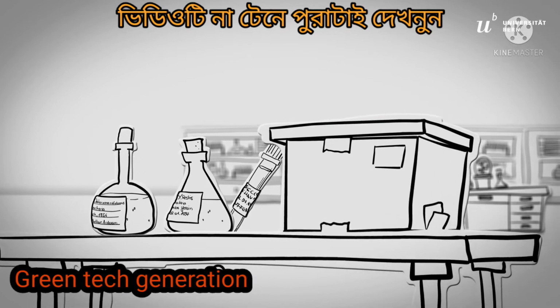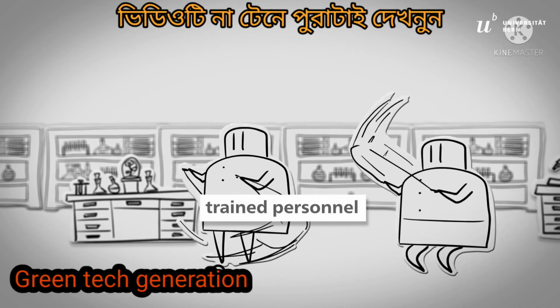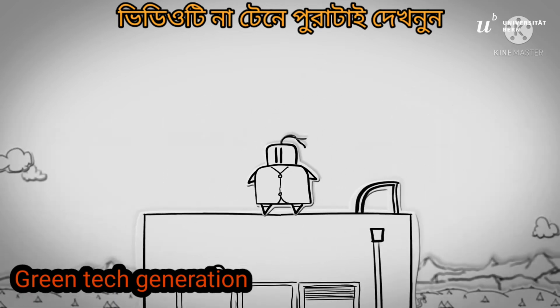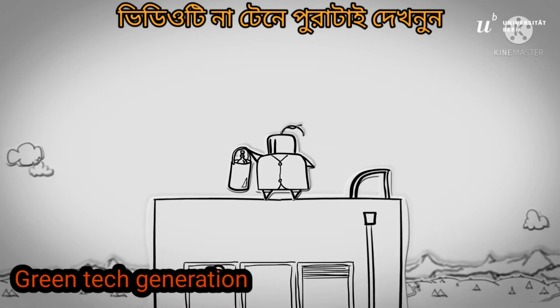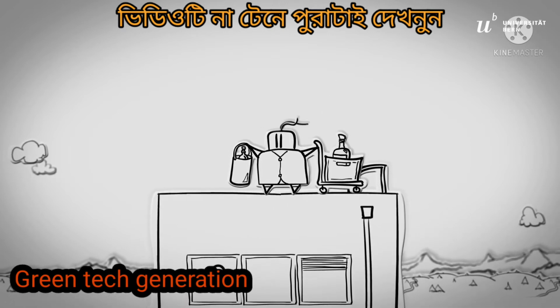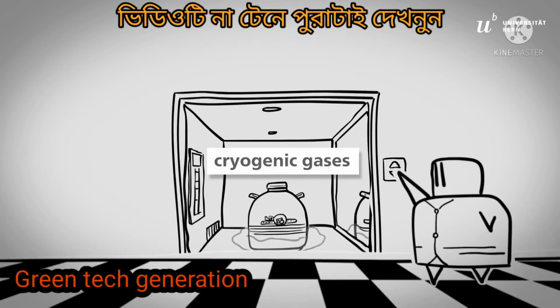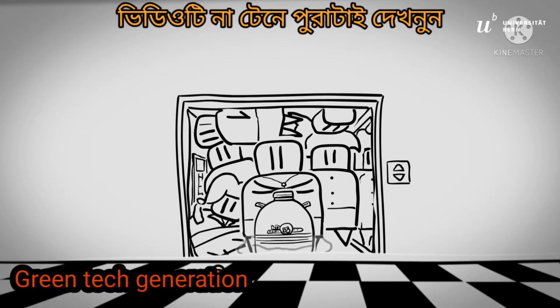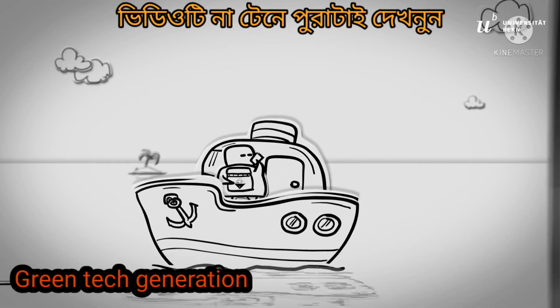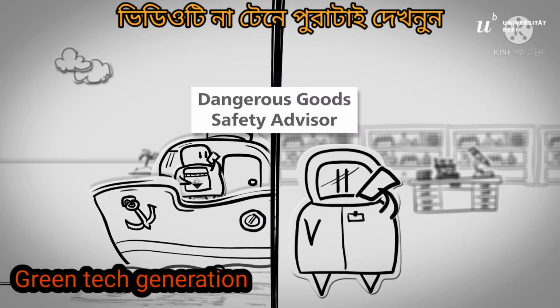When chemicals need to be transported, only trained personnel are allowed to do so. For transport inside or between buildings, place the sealed and labeled container in a hand basket or in a box on a hand cart. When transporting cryogenic gases in an elevator, no people are allowed inside the same elevator. For national or international transport, consult the Dangerous Goods Safety Advisor from the Risk Management Department.